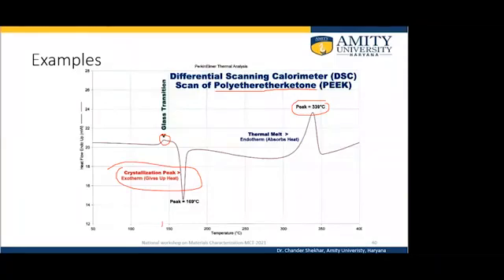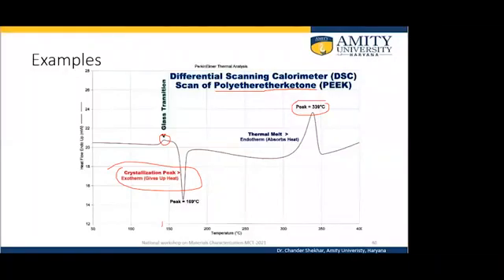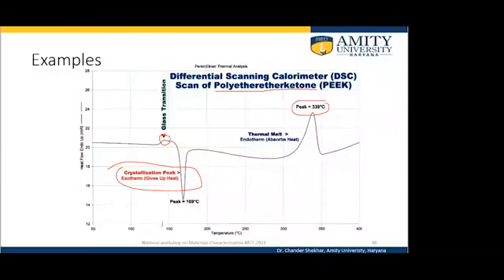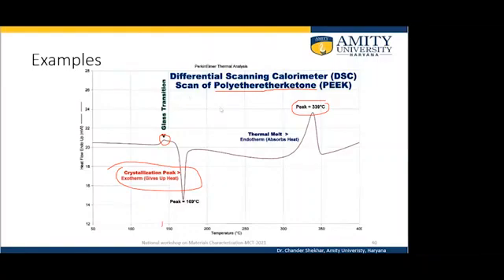Any other query? Sir, there's a query from my side. What is the material of the inert sample, since it doesn't undergo any transition? It is alumina powder. Generally, other materials, for example gold and platinum, are also used as inert materials. All right, thank you.